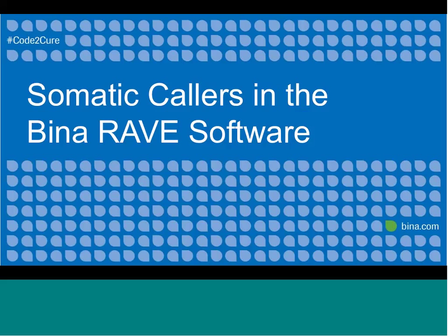Okay, thanks, Leetai. Now, with respect to the somatic callers, I'll let you know where you can find them in the Bina Rave software. SomaticSeq, as Leetai has mentioned, is available via GitHub, and it will be available in Bina Rave in an upcoming release.